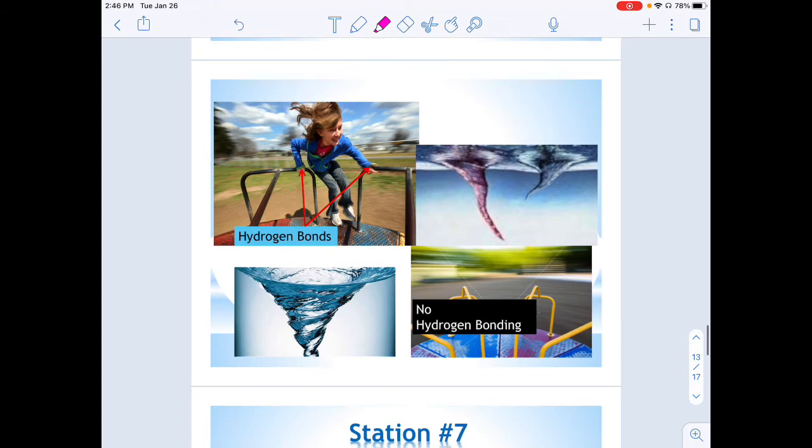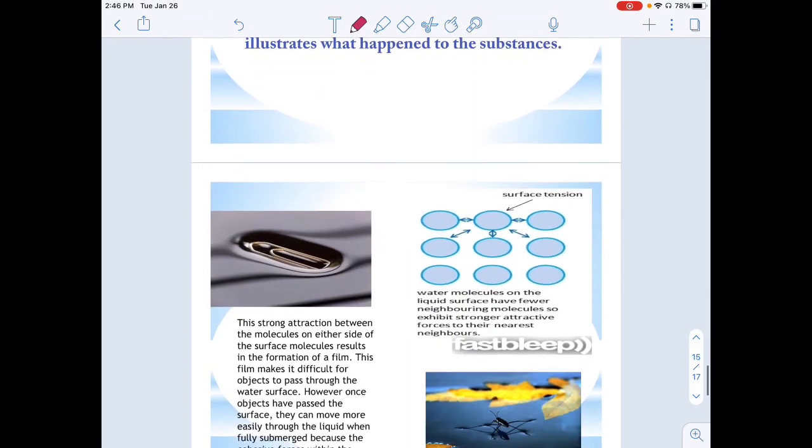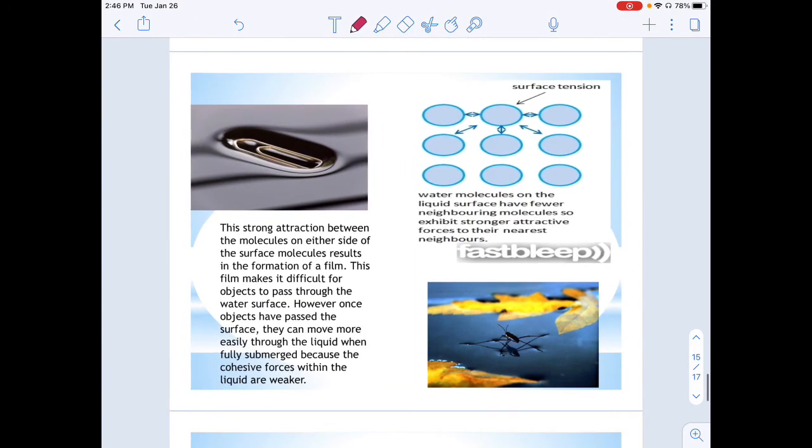When we look at the vortexes, this would have been considered the water. This one's kind of tough to look at, but it's harder to pull that water down. Cyclohexane formed a really big vortex very fast because you simply could pull it down really hard. Water doesn't form as big a one as quickly as cyclohexane.